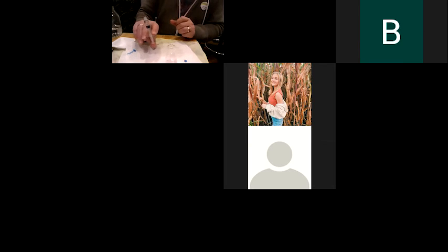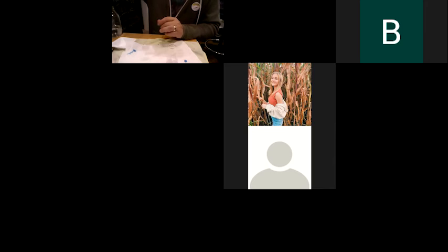So get all the air bubbles out. There we go. Yeah, I'll do 1. So 1 mil of vitamin C. There we go. So half the volume we used last time. So I want to see if we get the gold color or the blue or green color.